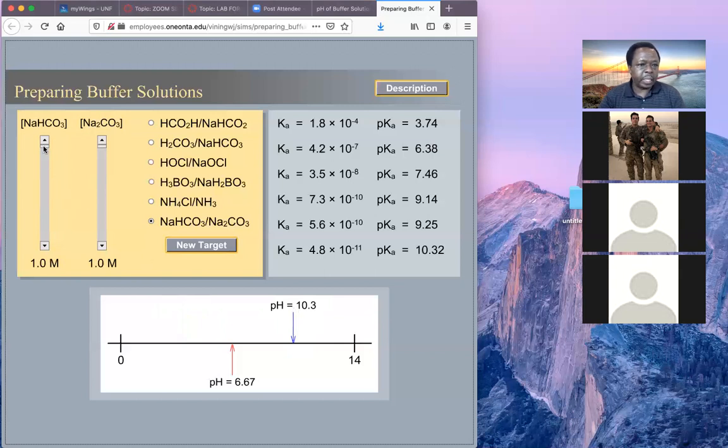So it's much easier to change the concentration of the base and acid. I think we may want to work with 1 decimal point. Let's work with 1 decimal point. I'll correct that. I'll refix the data sheet because I see I pasted 2 places of decimal on the data sheet, and it's going to be very difficult for you. Let's work with 1 decimal place.